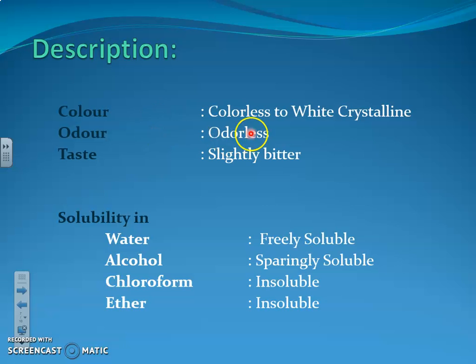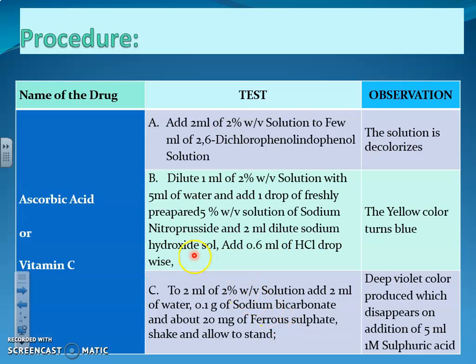Next, these are the descriptive terms for this given drug: colorless to white crystalline, odorless, slightly bitter taste. As far as solubility is concerned, it is freely soluble in water, sparingly soluble in alcohol, and in chloroform and ether it is insoluble, or we can say practically insoluble.